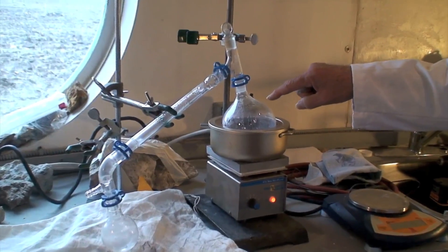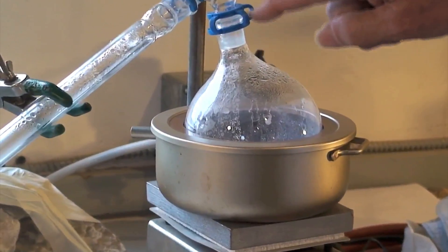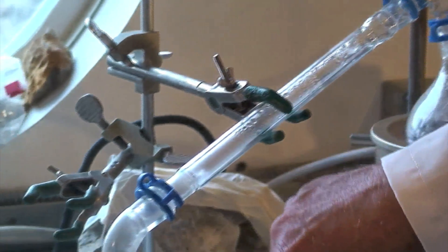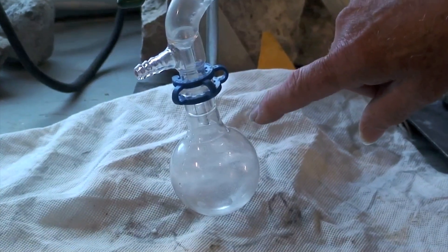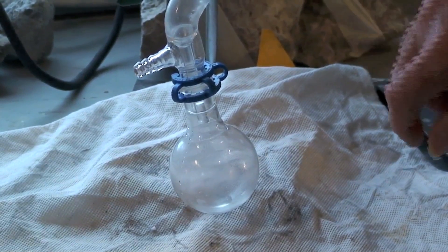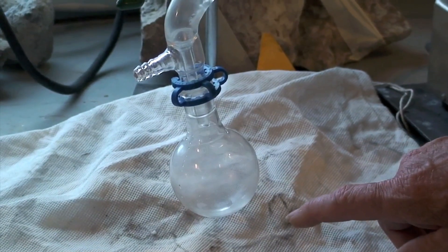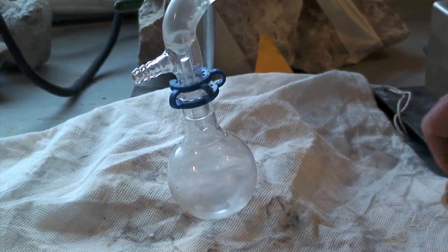Notice the water being driven out of the gypsum — it is condensing here, created by the steam, coming further out along the tube. We can see where it is being condensed along the tube. In fact, there is a drop of water getting ready to fall. If I give it a little tap — there we go. We actually have water that comes out of rock, and a little more water is still coming out.